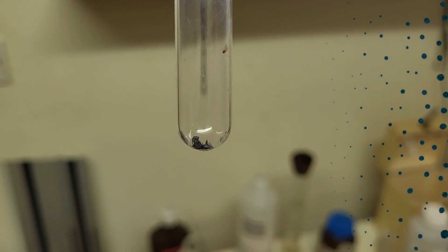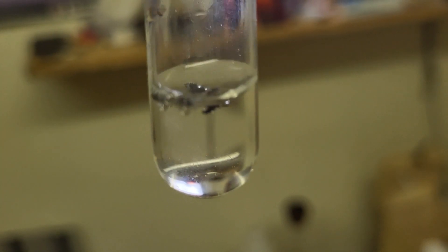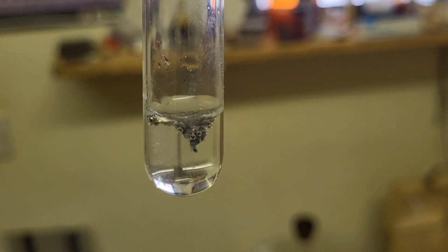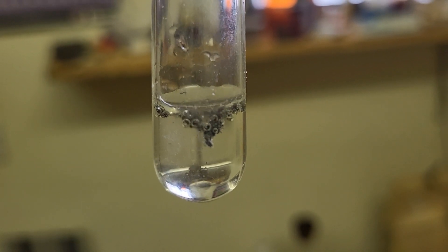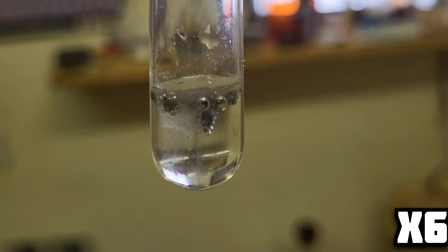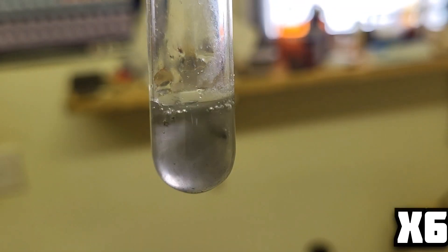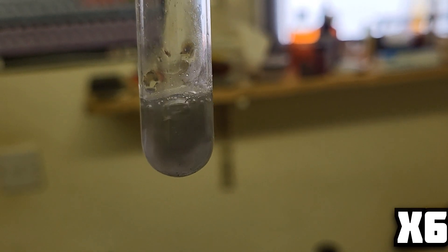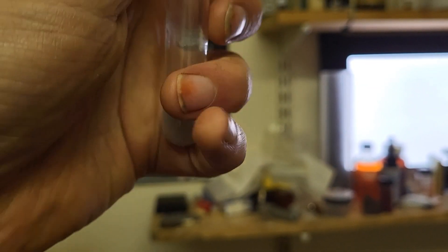I've got a few crumbs of calcium. I'm just going to demonstrate what it does in water — it does react, but not very much. Getting faster. Hydrogen is liberated and it's ever so slightly warm.